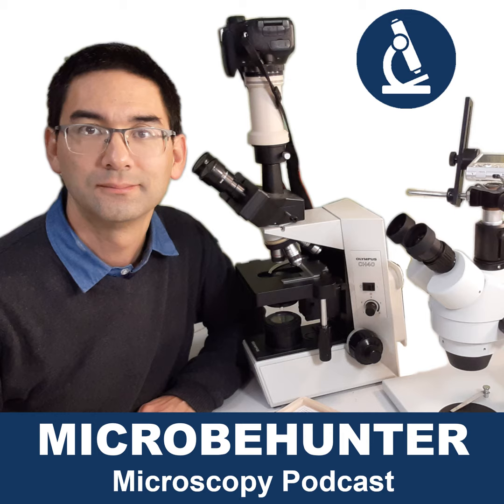Spinning the fine focus knob when focus is lost. I've also seen this, that sometimes people completely lose the focus, and what they do is they try to find the focus by rapidly spinning the fine focus knob, and that's also not really meaningful, because it simply takes a long time, and you're much faster by rotating the 4 times low power objective into position and then starting all over again.